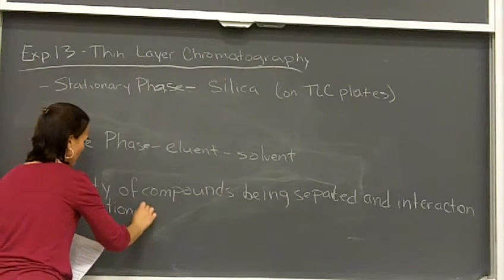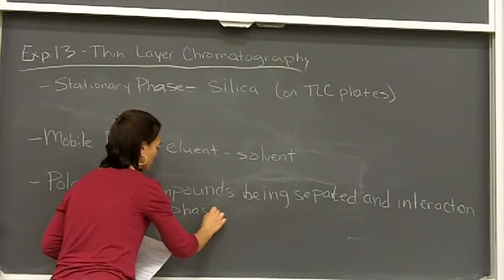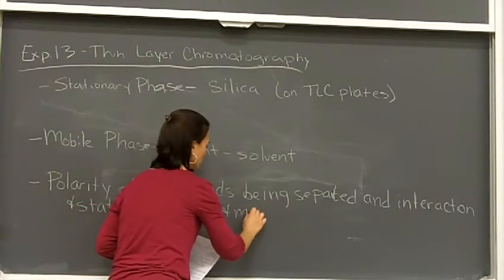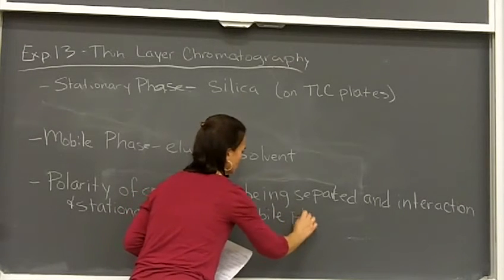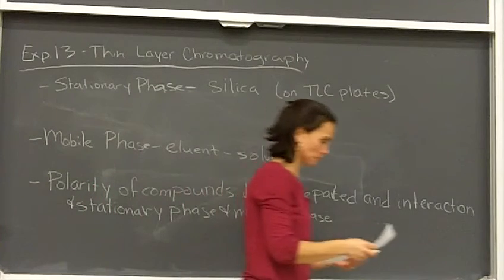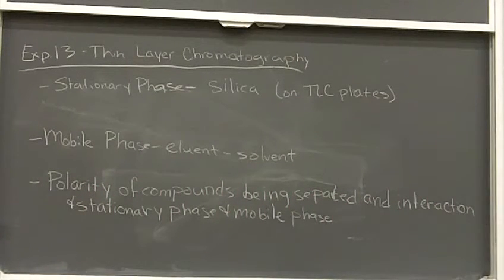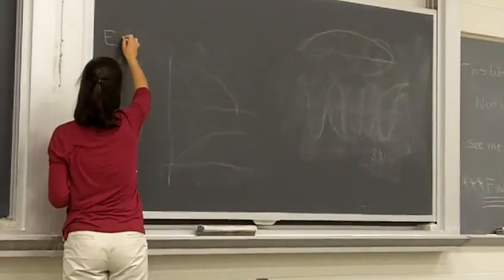But it's all based on polarity. Okay? And so what you've got going on is this equilibrium.